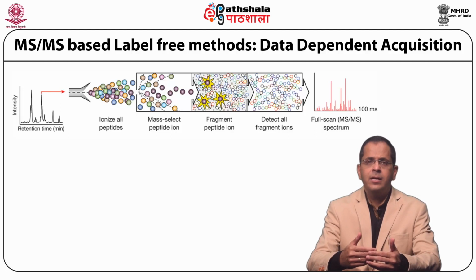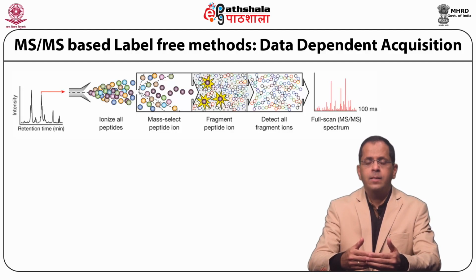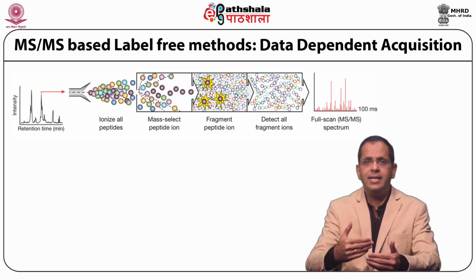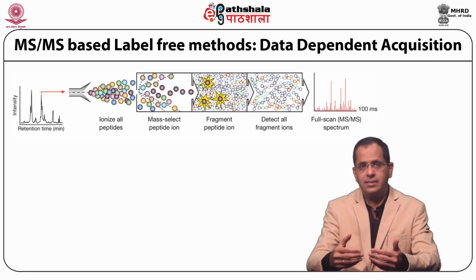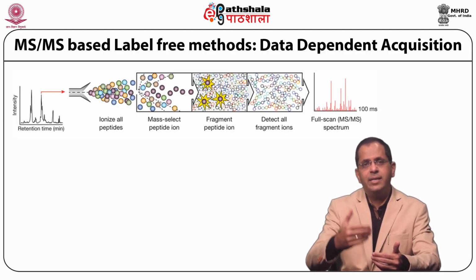In the technique, for two samples that need to be compared quantitatively, a liquid chromatography associated MS/MS experiment is performed for both the samples separately, and precursor ions, mass to charge, and the retention time (RT) file for all the MS/MS spectra of each identified protein is created. Depending on the mass spectrometric acquisition mode, two analytical methods, that is data dependent analysis and data independent analysis, could be carried out.